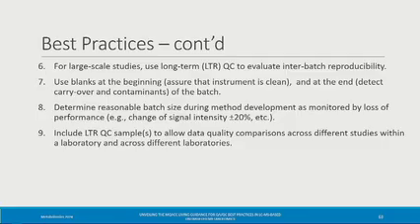You need to include some long-term QC samples to allow for data quality comparisons across different studies within your lab or across different labs, so that you can compare your results from this study today with a study that you ran 2 years ago and a study you're going to run in another 2 years to make sure that all those results are comparable.